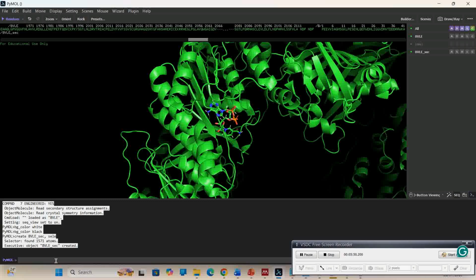So what we will now do is to say save, let's say 8VLE, oh my bad, I beg your pardon, 8VLE, let's call it section so that we can differentiate it in our working directory. 8VLE section, let's just say clean, CL as cleaned, .pdb, and then comma, save it from where? 8VLE underscore SEC.